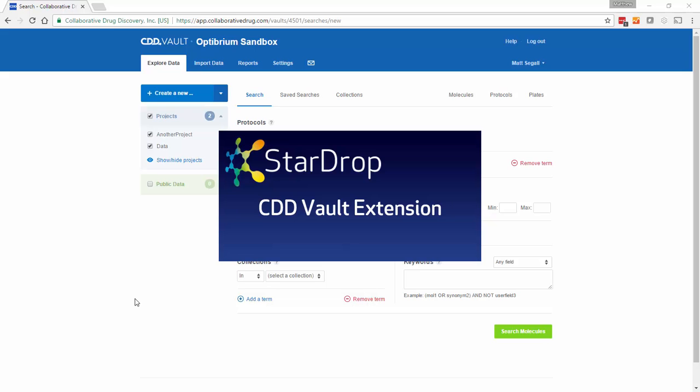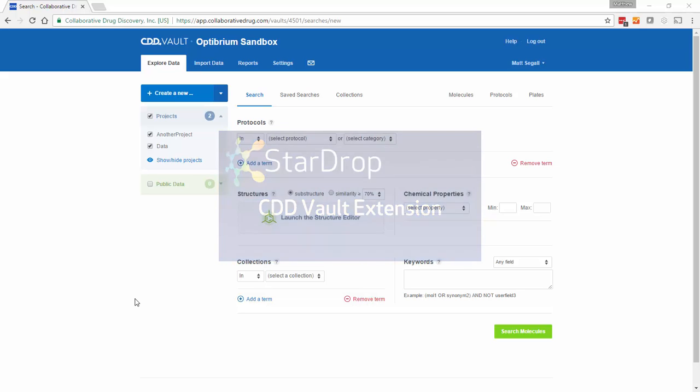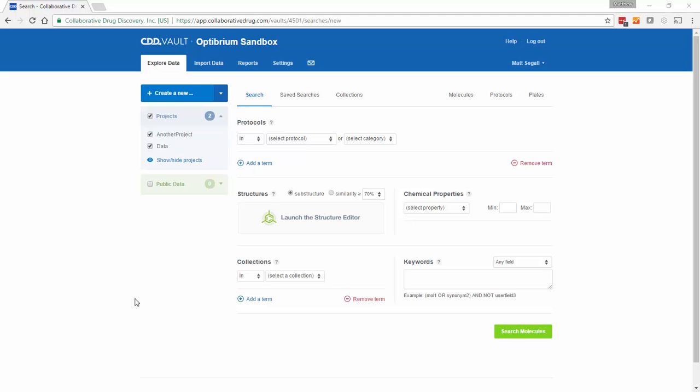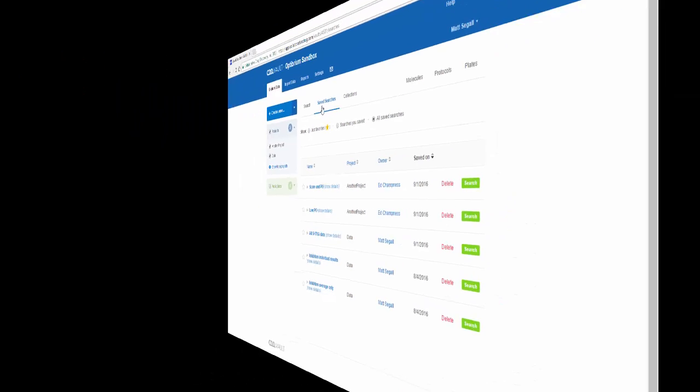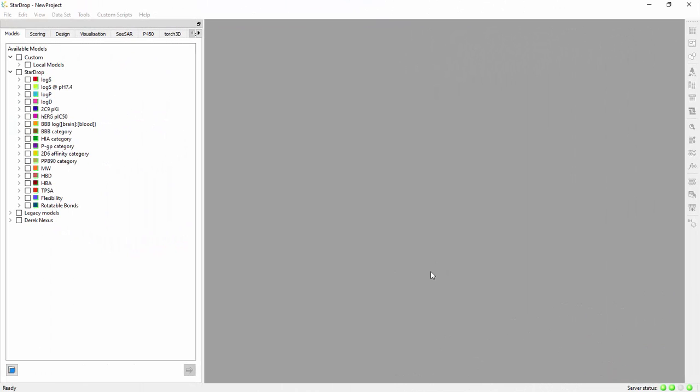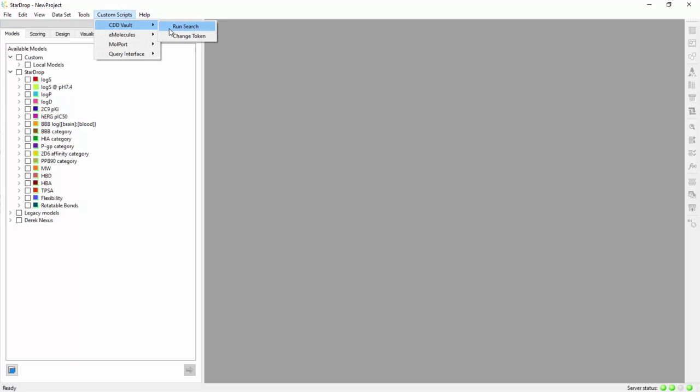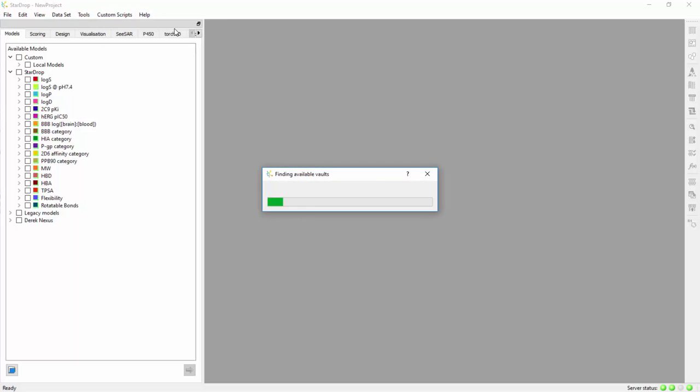StarDrop's CDD Vault extension provides seamless access to data stored within Collaborative Drug Discovery's cloud-based Vault platform. Predefined searches can be saved within CDD Vault's web interface. Selecting the CDD Vault option from StarDrop's custom scripts menu provides a list of searches saved within your vault.